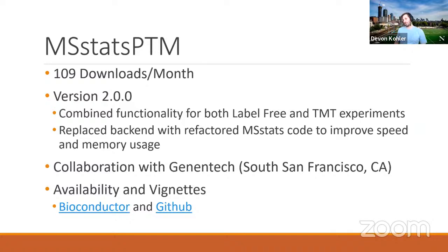On the development side for this package, I think I mentioned before, but we are actively working on integrating the package into MSstats Shiny. One of the challenges with doing that is that since the package is pretty new, we don't have as many converters as we do for base MSstats and MSstatsTMT. So we are actively trying to build more converters into the function. Right now, the main converters we have are for MaxQuant and Progenesis. And it's doubly hard because we also have to find converters for TMT and different types of experiments.